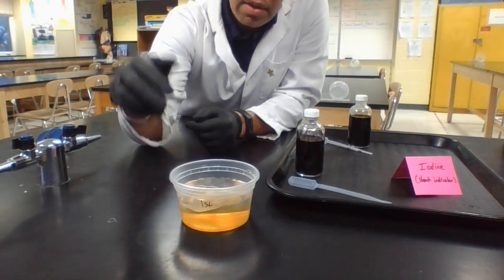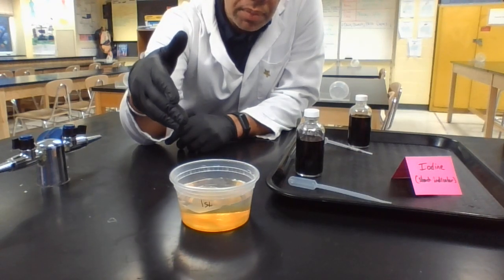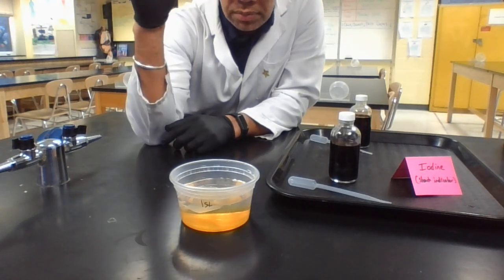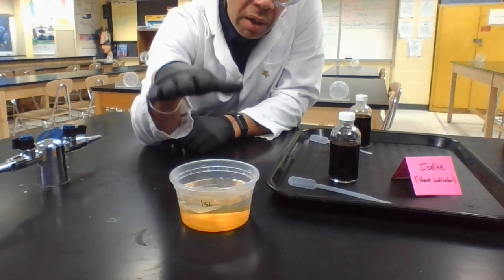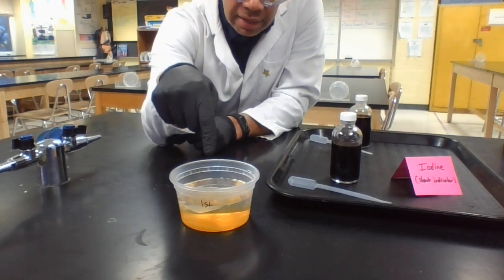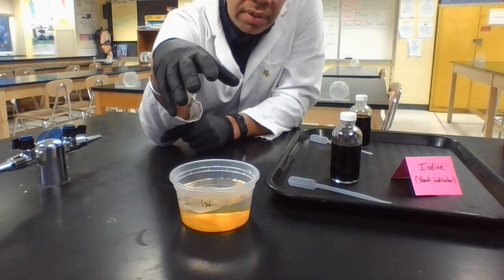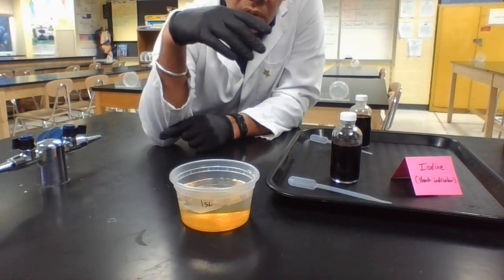So as you see now, the iodine has a nice kind of brownish color as it's concentrated, and then as it's diluted into the water, it becomes a little bit more of a lighter brown. Okay, we're going to let this sit overnight, and you need to think about what we know about iodine. We just learned about iodine and what's in that bag, aka the small intestine. What do you hypothesize will happen after 24 hours? Okay, so when we come back tomorrow.